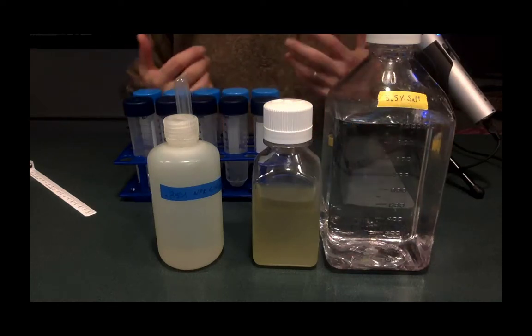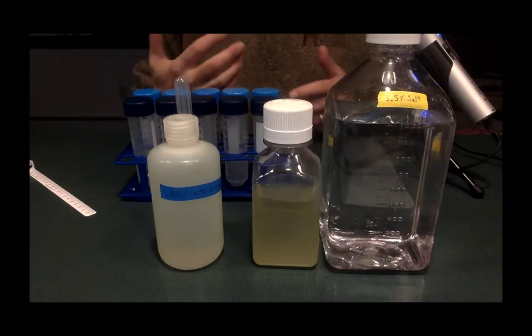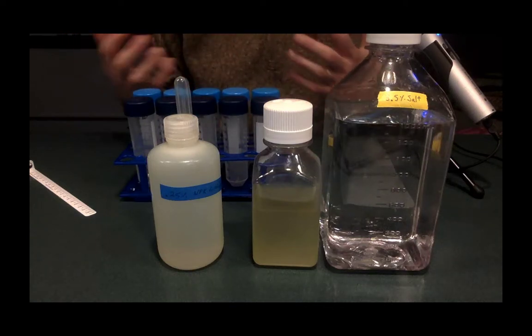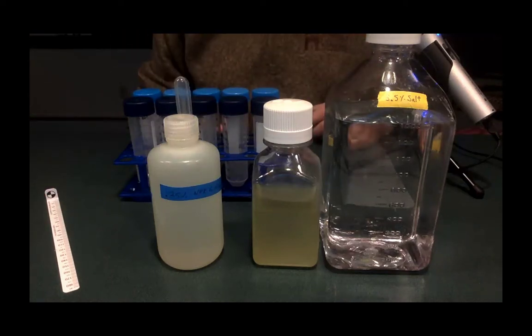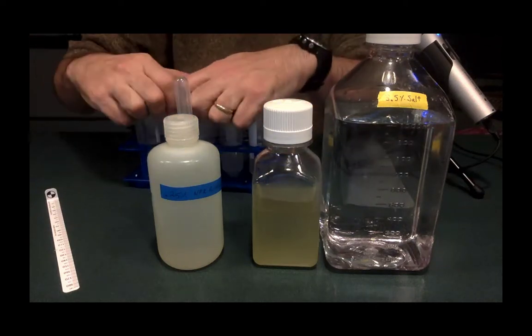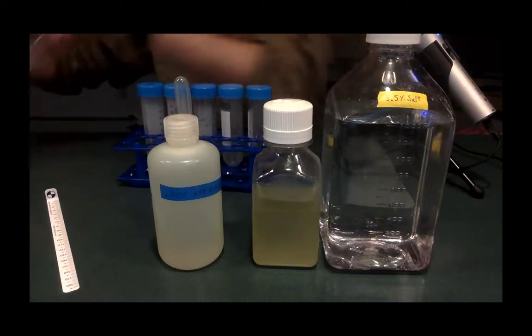And so in this particular case, I'm asking the question, how does adding fertilizer impact the growth rate of my algae? So that's my question. Does it increase it? Does it decrease it? At what rate does it increase or decrease? Those are the types of things that I'm looking at. So I'm actually going to get rid of pretty much all my tubes except for just the one tube of interest for myself. So I'm going to take these and lay them off to the side.